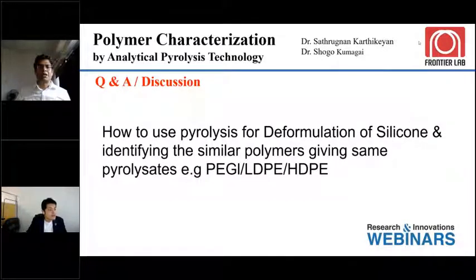Can I ask Dr. Shogo to answer this one? Personally, I do not have much info on this. Otherwise, we will take this offline. Yeah, that's a very difficult question. Actually, it's hard to identify the type of low density and high density polyethylene. But basically, the low density and high density have different branching, so it might be possible to check the pyrolysate composition.